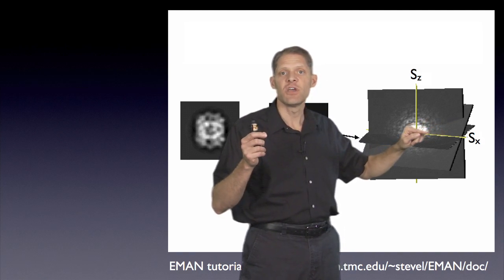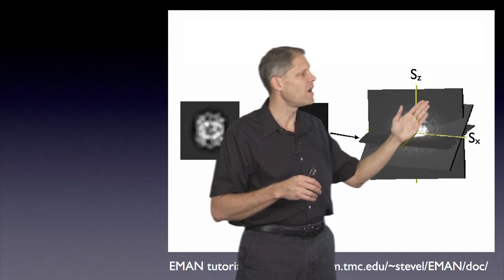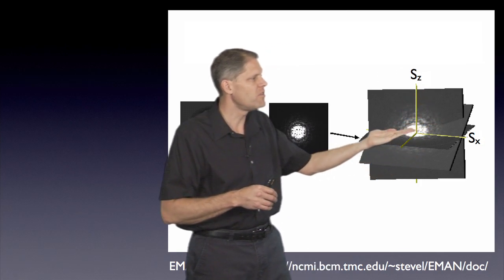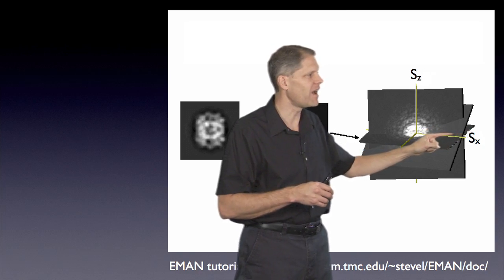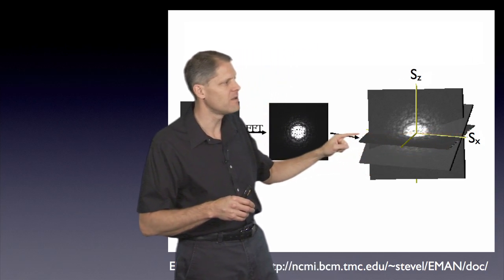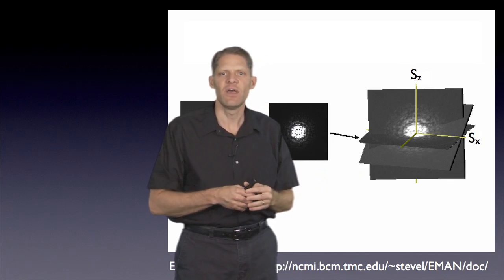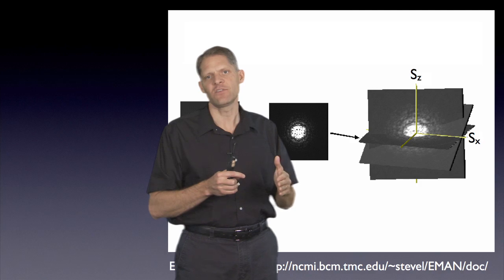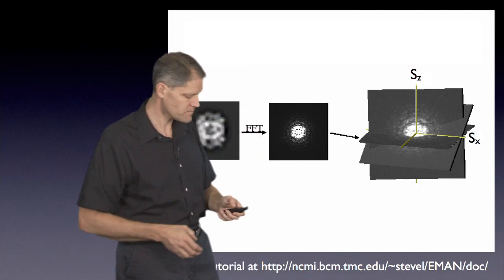Then we can search for which line this third transform has with the original first transform. And if we can find that line that they have in common, then we have a fully determined system that should reveal how all three planes should be oriented within the reciprocal space.